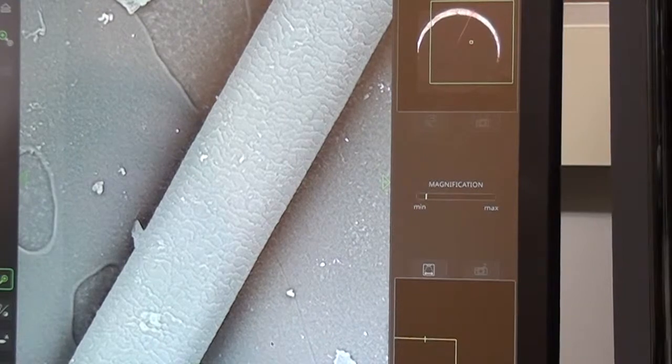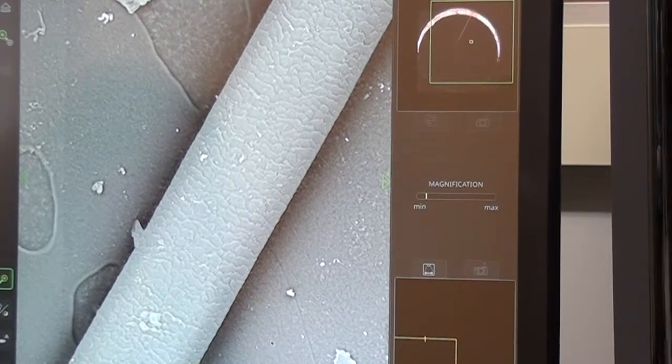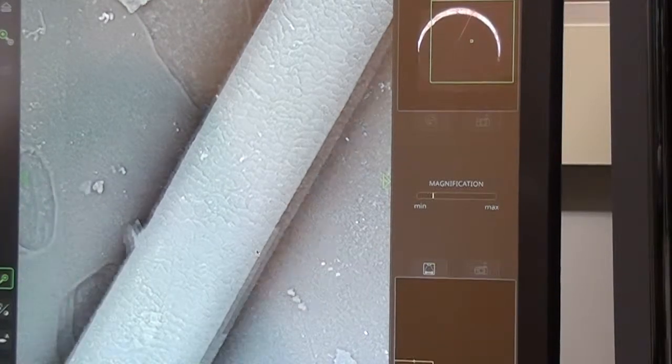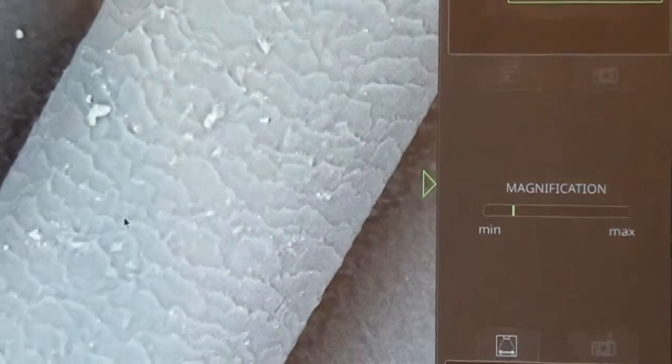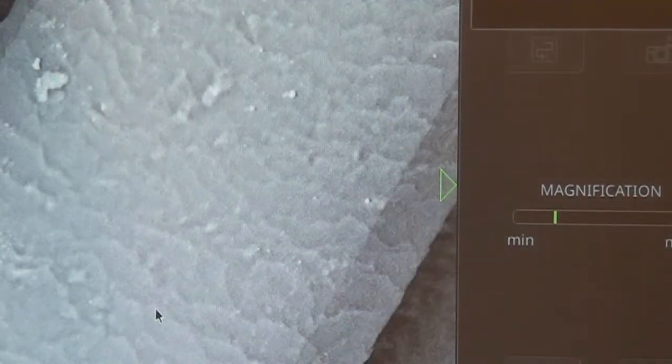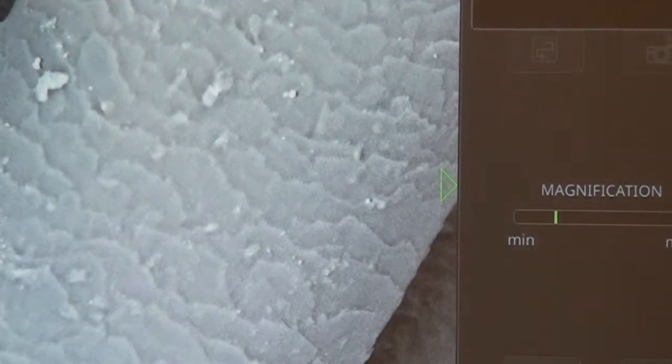In this case, we're looking at my hair, which you can't see, but my hair is curly and rather large. So I use a leave-in conditioner and a curl cream in an effort to keep it under control, which is why you're looking at the hair here with its scales, which you can see better and better as we zoom in.